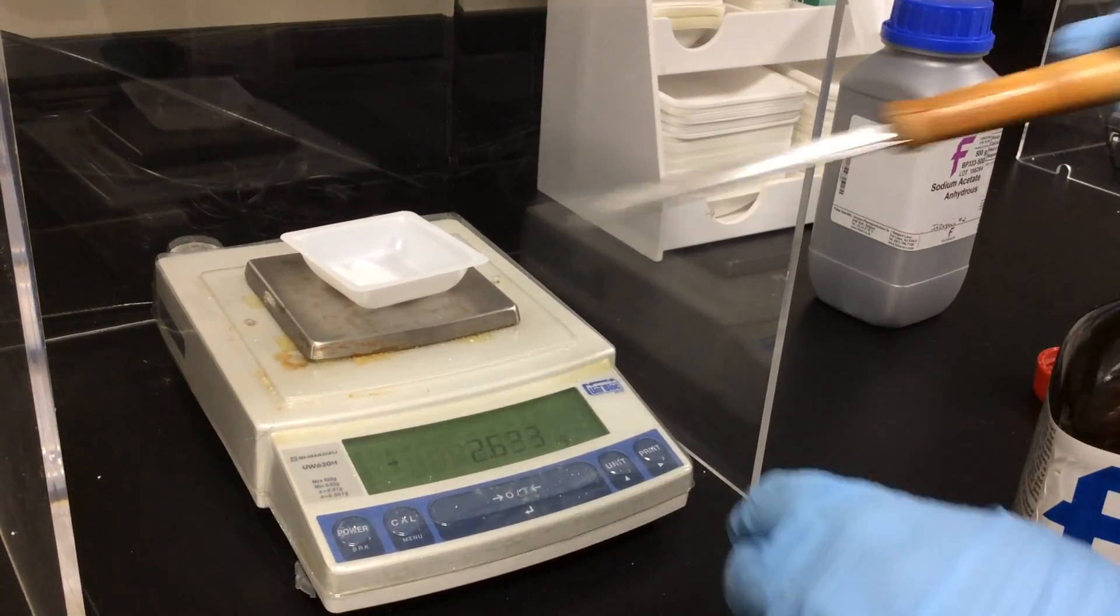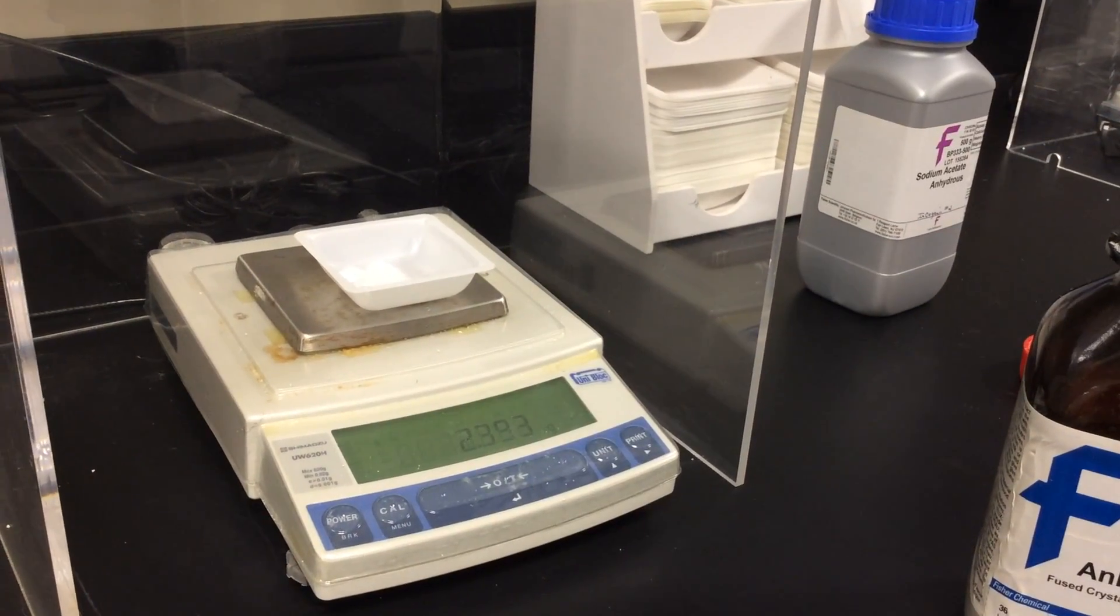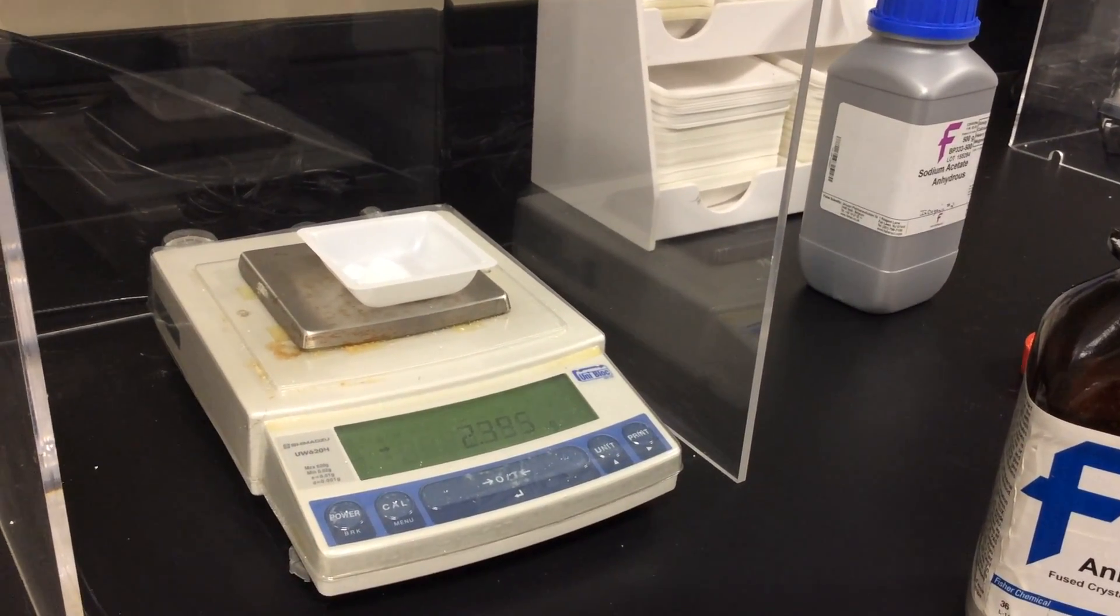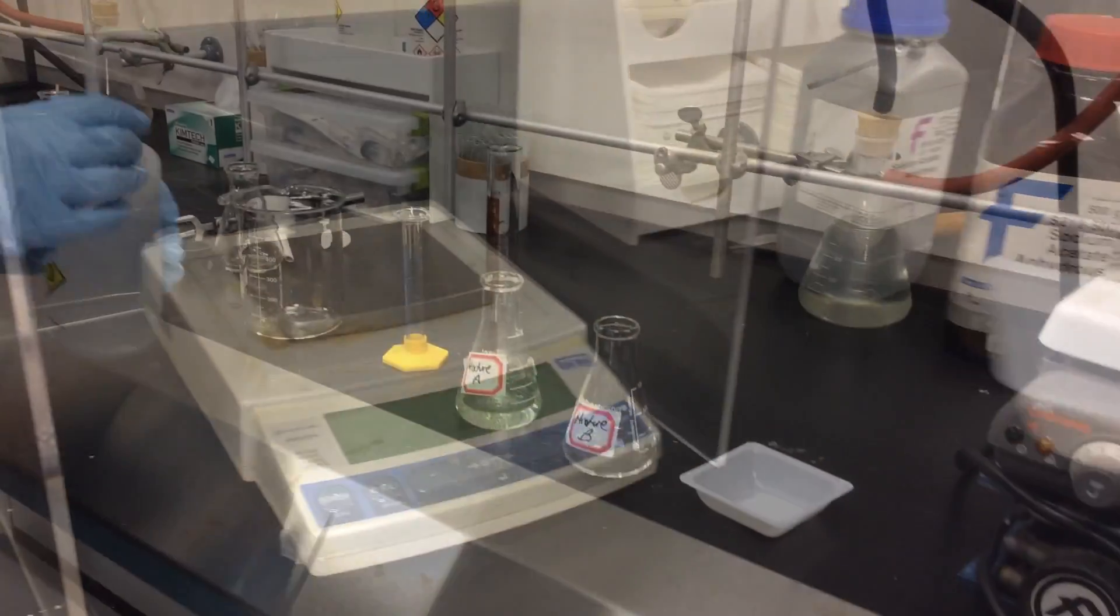If you have too much, like here's 2.6, you can take a little bit off. We finally get 2.3945 grams, and that will work. Then we're going to take it over to our hood.